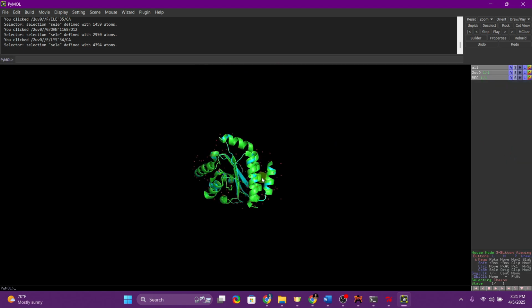Now I can see that this is the protein molecule that I was working with. Initially, when you are processing, you can also save this structure as a separate protein-ligand complex, because you require this complex when you are trying to identify the site in AutoDock Tools to get all those XYZ dimensions.